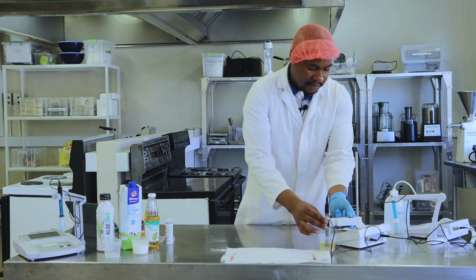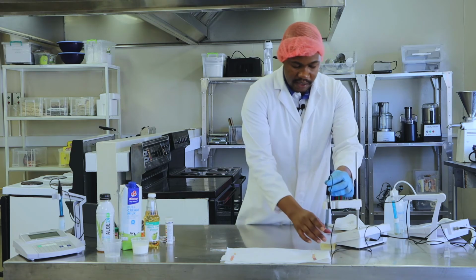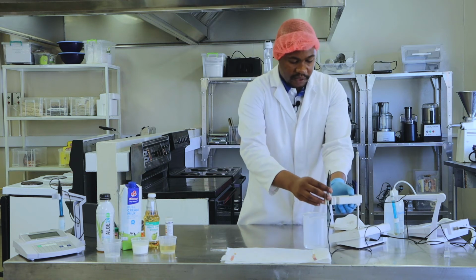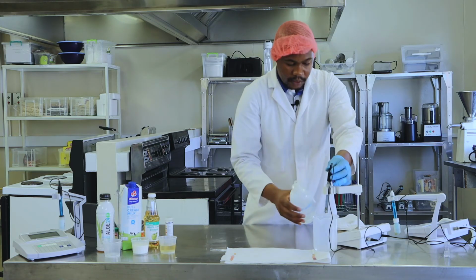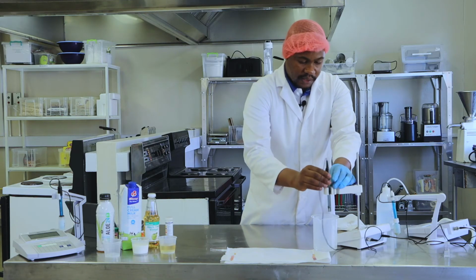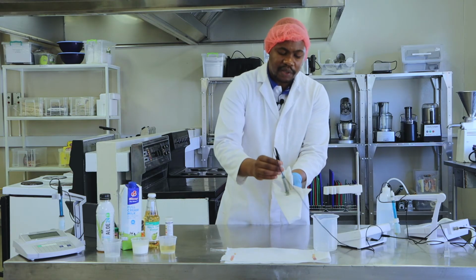And then once I'm done, I can take my probe up and remove the apple cider vinegar, put it here, and then I can bring this part over here. This is what I can do. Just wash and wash and wash, and then you can take it out and blot it very nicely.